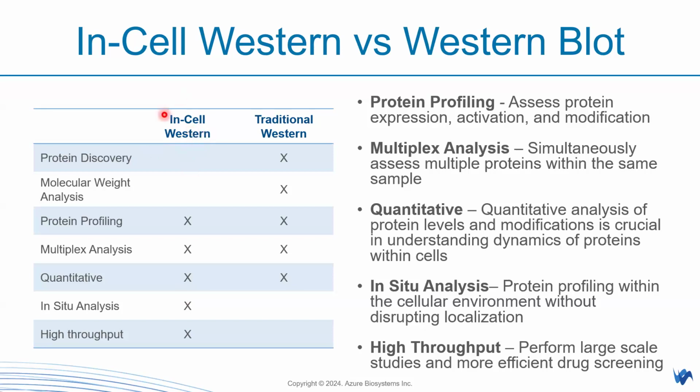It can be used to answer questions that normally require multiple replicates or testing different conditions. Let's say you have different groups and harvesting time points, that kind of situation. Overall, it gives you a lot of results in an efficient and very cost-effective manner. Okay, so some of the examples, as I mentioned before, will be drug screening and so forth. One of them will be cell signaling studies.